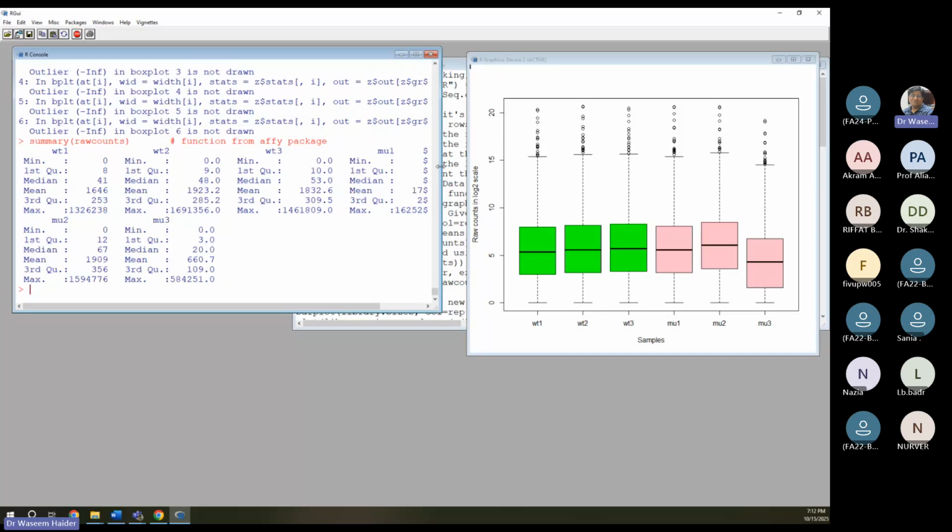Dr. Nazia, are you here? I think R's graphics is much better. Agreed or not? Assalamu alaikum. Walaikum assalam. How are you, Dr. Nazia? Are you there? So what are your thoughts? Is not this graphics better? Yes, absolutely sir, I am of the point of view that R's graphics are really better, plus this is quite easy to get this very fine graphics. Otherwise for Python, I have to adjust so many things. I can get this quality, but I will have another thing to work, it is a lot. And you need to borrow everything.